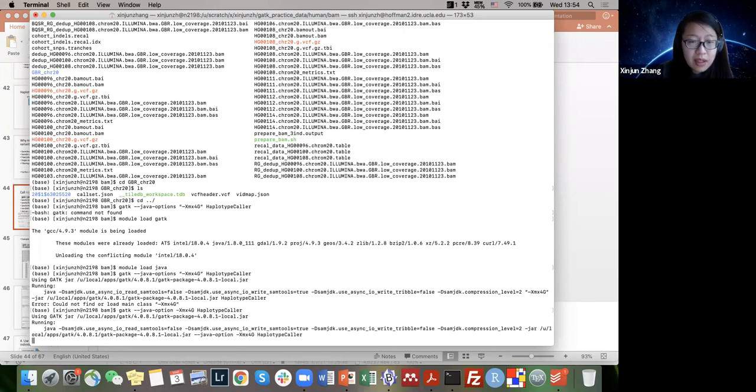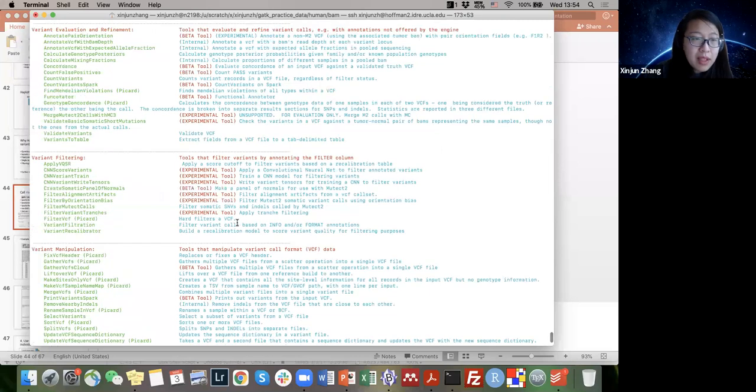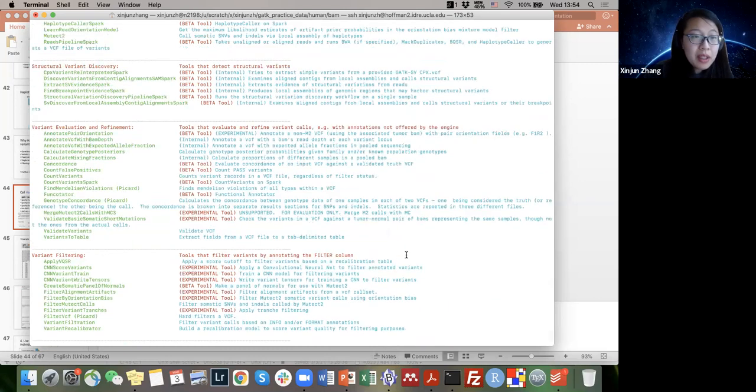Yeah, it seems like it's working now. So when you copy and paste commands, I recommend doing that through BBEdit or any other text editing file, in case there's something happening on the slides or PDF.